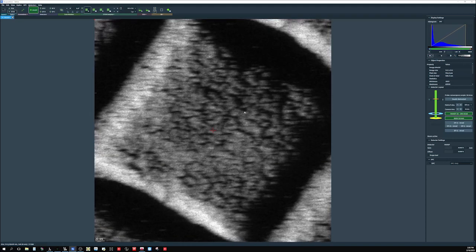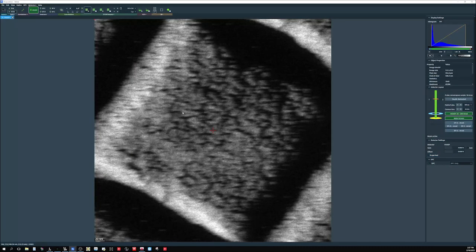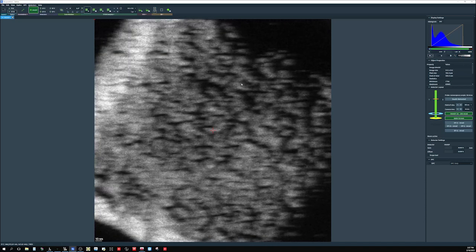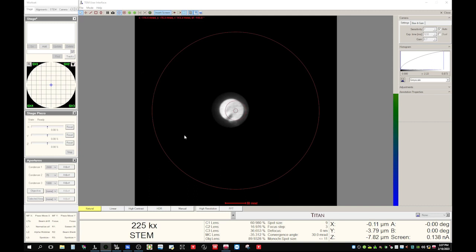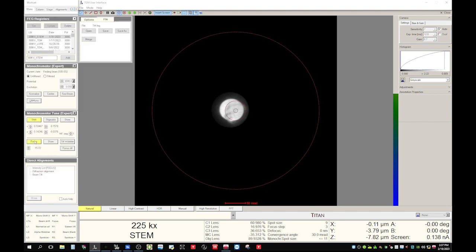Let's take a look here — we should be at this magnification. At this magnification, roughly one square is centered in the field of view. We can adjust the Z height a little bit more to get better focus. Let's stop and come back to the TEM user interface. As we just found the beam with the mono shift, let's fine-tune the mono shift by going to mono and monochromator tuning.